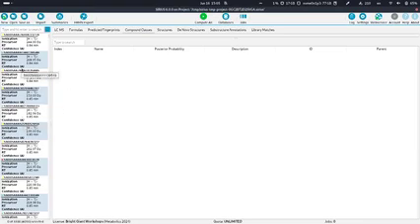And it's just this traffic light, red, yellow, and green, where we say red, we cannot decide if it's noise or not. It looks really bad, but it could be still a real feature. So that's the three types of compounds you should look at.